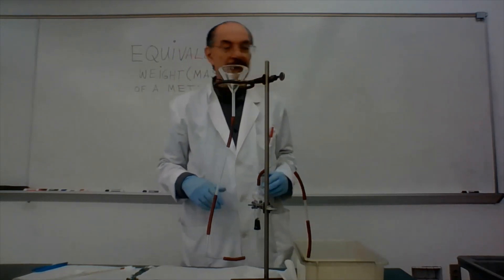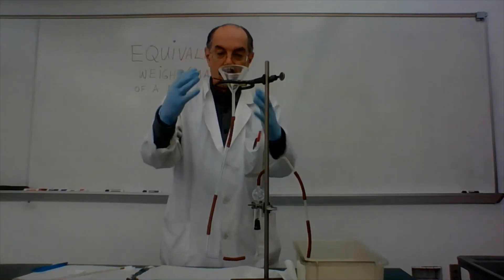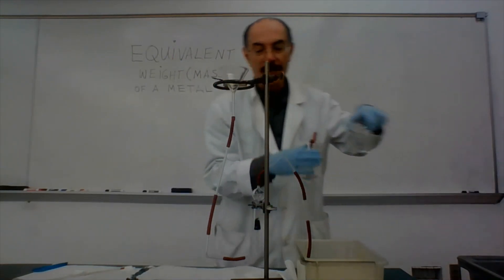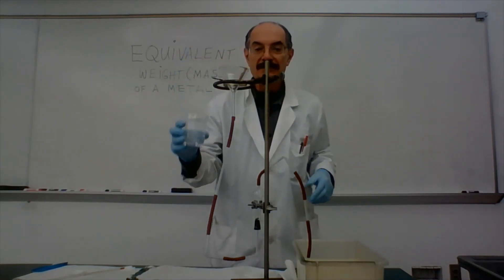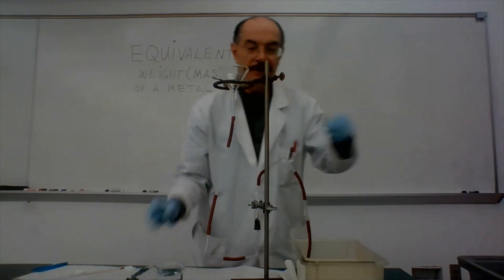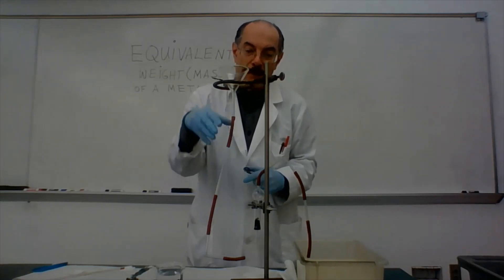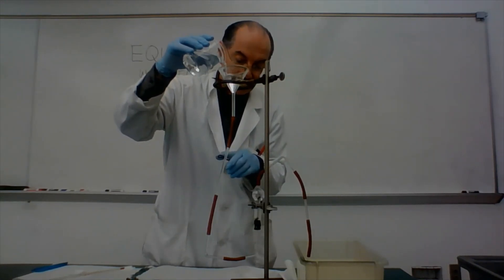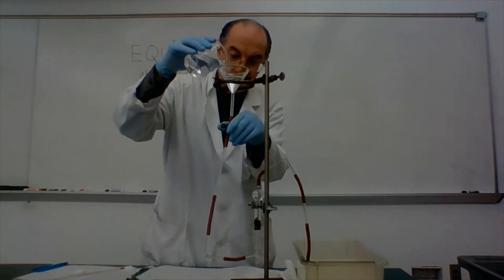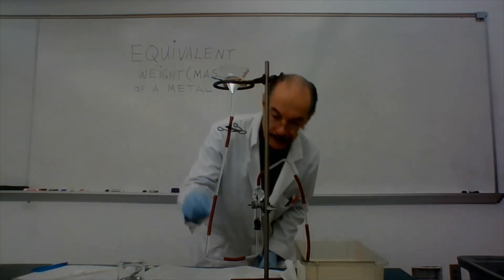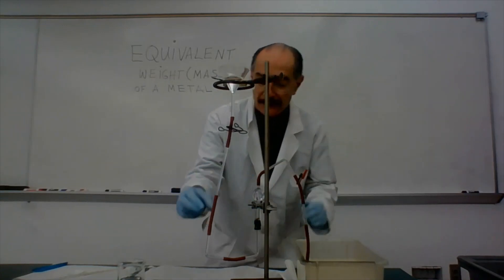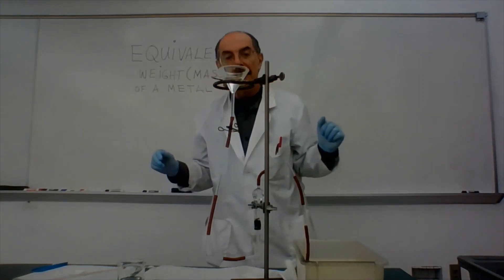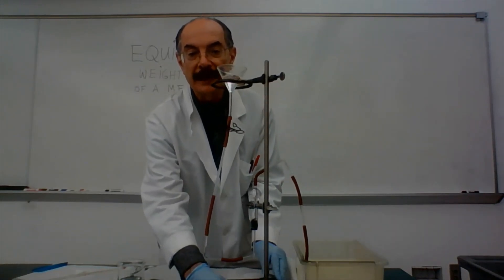And now I'm all set. And what I want to do now is I need some water to chase this with. I want to generate a siphon of water all within this system that goes all the way to this reservoir. So you're probably better off taking a beaker of water from the sink. It can be tap water. And have your pinch clamp ready because when this whole thing fills up, I want to hold it in place. So I'm going to start pouring the water. That way I can check that there's no bubbles trapped in the system. I can check that there is no leaks. And once it's full, I'm going to clamp it and I'm going to inspect visually, make sure there's no water leaking out of anywhere. Make sure there's no bubbles. So you might want to squeeze a little bit on this thing at different points. Make sure there are no bubbles anywhere. So my system is now sealed.